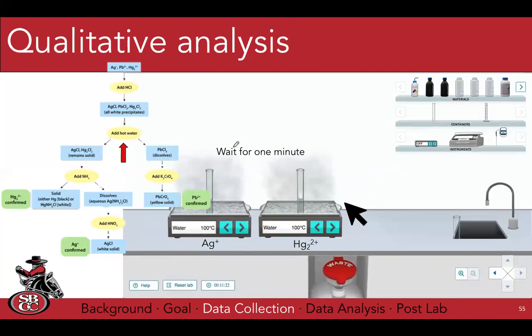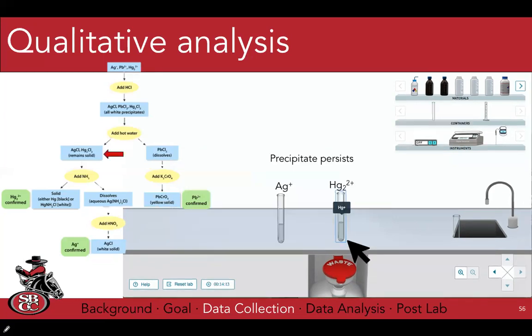So your instructions say wait for 1 to 2 minutes. I would just emphasize that you wait longer than it took for the lead to dissolve, and to really record how long you waited, so that you can make sure that in the unknowns, you are doing the protocol the way that you calibrated your sensors, so that you're able to really be confident in your assessments after the fact. And so we take them immediately out, and we see that the precipitation persists. So it doesn't dissolve in any way.